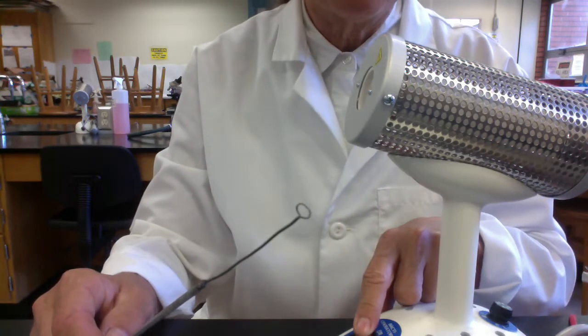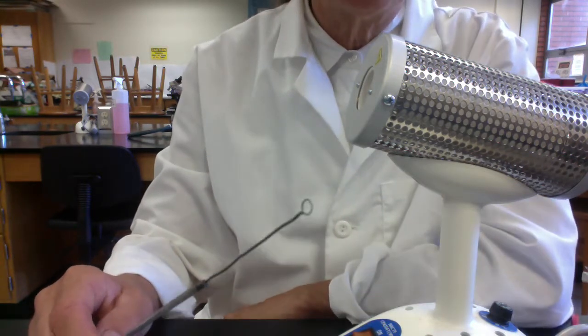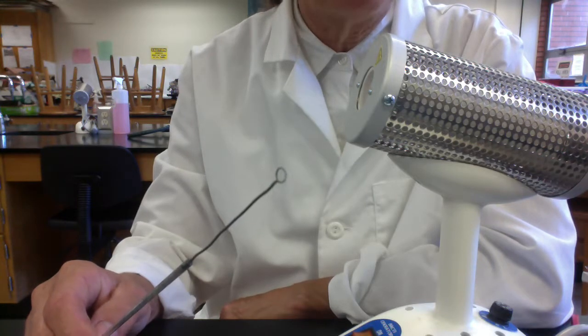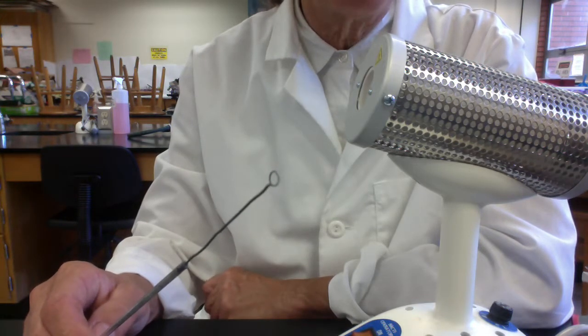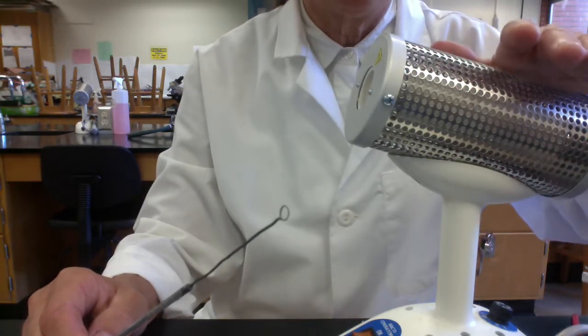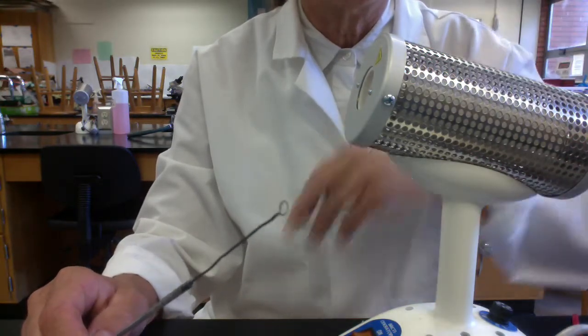And then you're going to turn them on. There's a little lever at the base here. And the recommendation is to let the Bacti incinerator warm up for five to ten minutes. Once it's warmed up, be really careful because the outside of the barrel here will be really hot and can burn you. So be careful that you don't touch that.